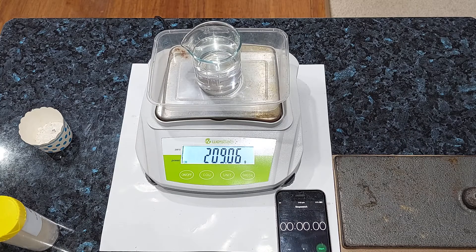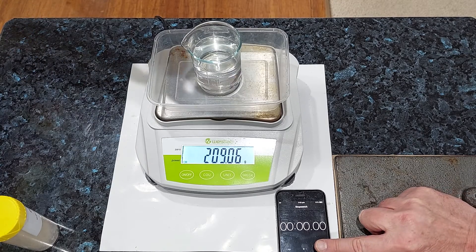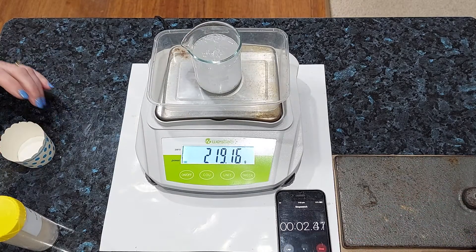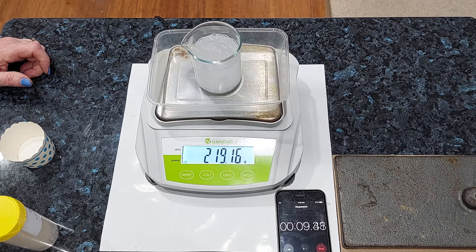Have you got that starting mass? Have you added the mass of marble chips? All right, we're ready to go. Ready, set, go. I bet you knew that was going to fizz. We're just going to go for the one minute mark and the two minute mark again.